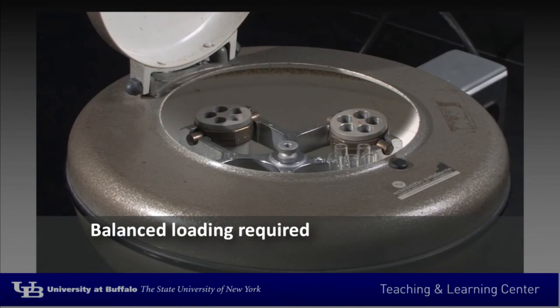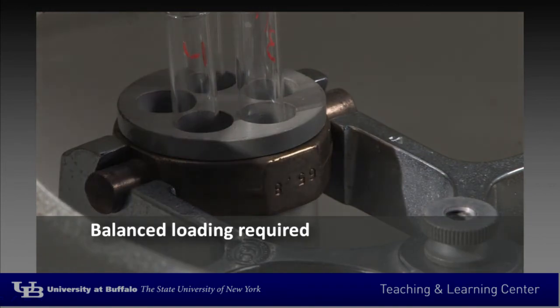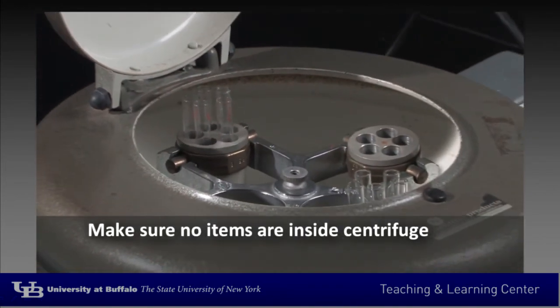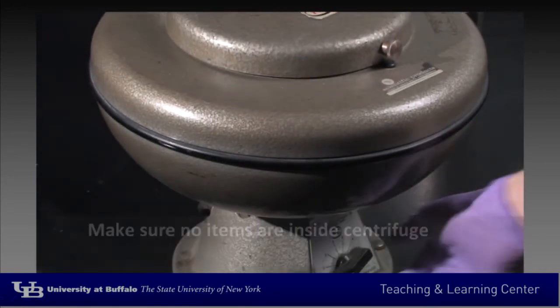Safe centrifugation requires balanced loading of the tubes to be centrifuged. Balanced tubes are placed across from one another. Also, at the time of loading the centrifuge, make sure that no other tubes or materials are in the centrifuge, as they would be thrown around the chamber during centrifugation.